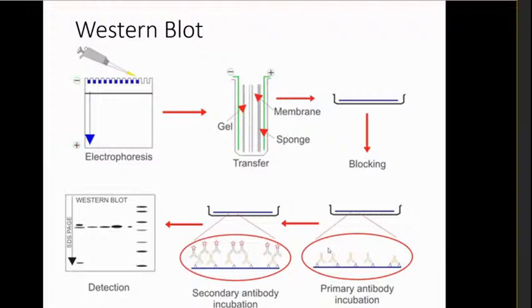if a specific interaction happens in the membrane, those antibodies are placed over the membrane. Then a secondary antibody specific for the primary antibody is added. If an interaction happens, it gives a band in the image, a membrane color change. We can understand the binding, the protein antigen and antigen antibody interaction, through the western blotting membrane. So in the Western blotting method, the membrane is a very, very important thing which helps in each and every step.